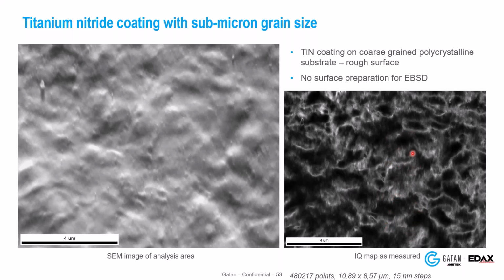Topographical materials show this type of contrast. Where it's black, it's more shadowed, as we think about the projection from a tilted surface to our EBSD detector. Here the beam is shadowed going into the detector. When we go to the other side of this ridge, it's brighter because more electrons can escape from a sample that's not flat. It's tilted a little bit more, so more electrons escape. So when samples are not flat, our image quality will show some topographical contrast.